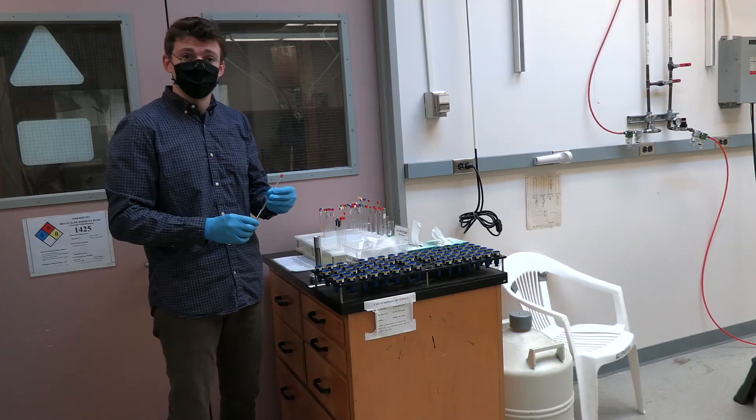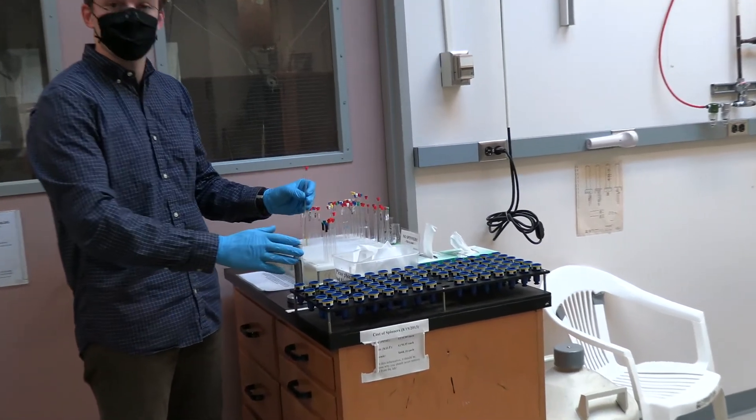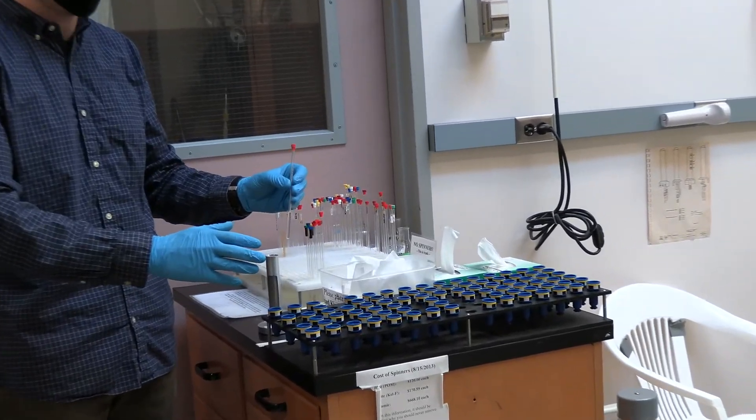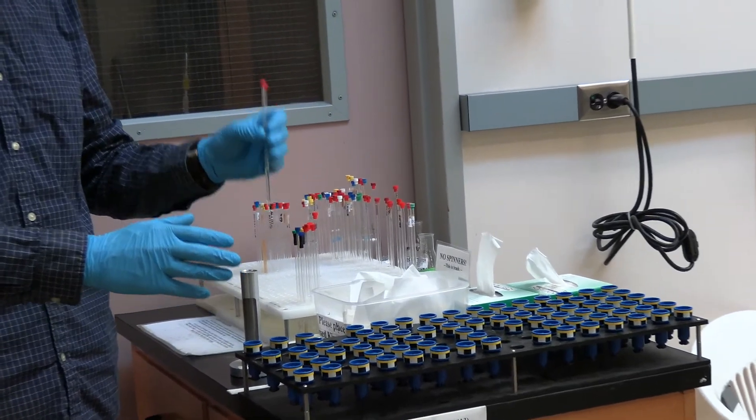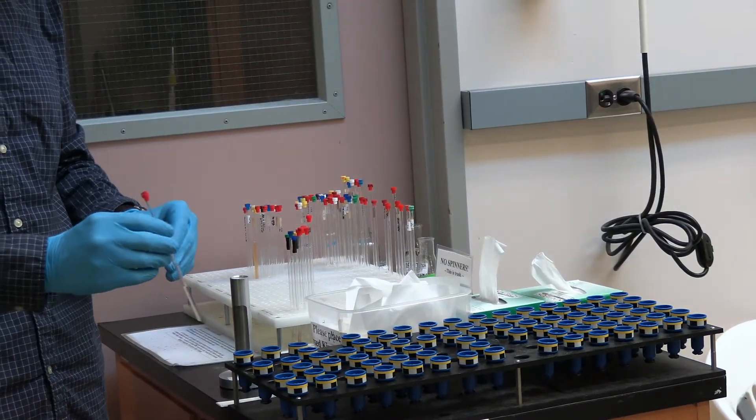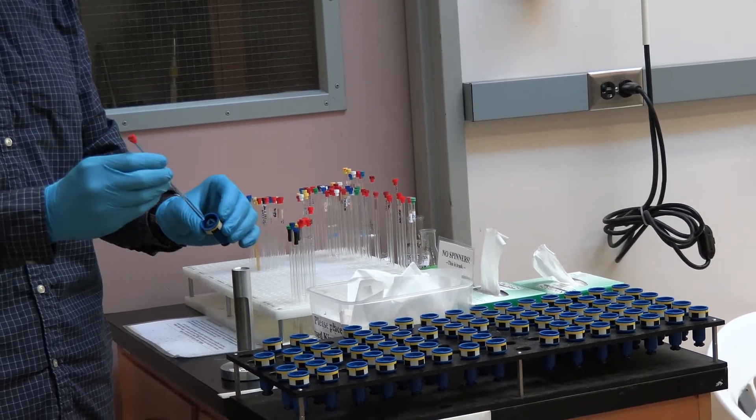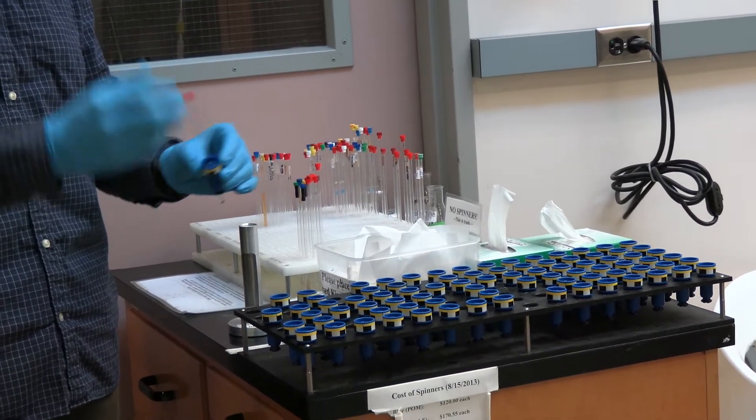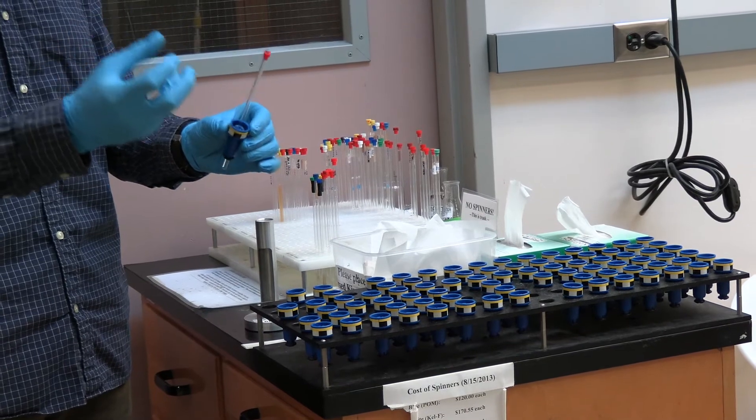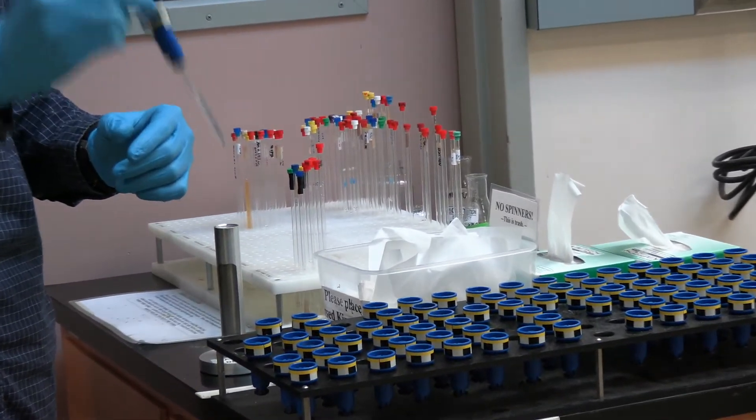The next step when preparing your NMR sample is choosing the appropriate spinner. There are 120 spinners located at the sample prep station and only 120 spots on the carousel, so ideally you should never have to grab a spinner from one of the other instruments.